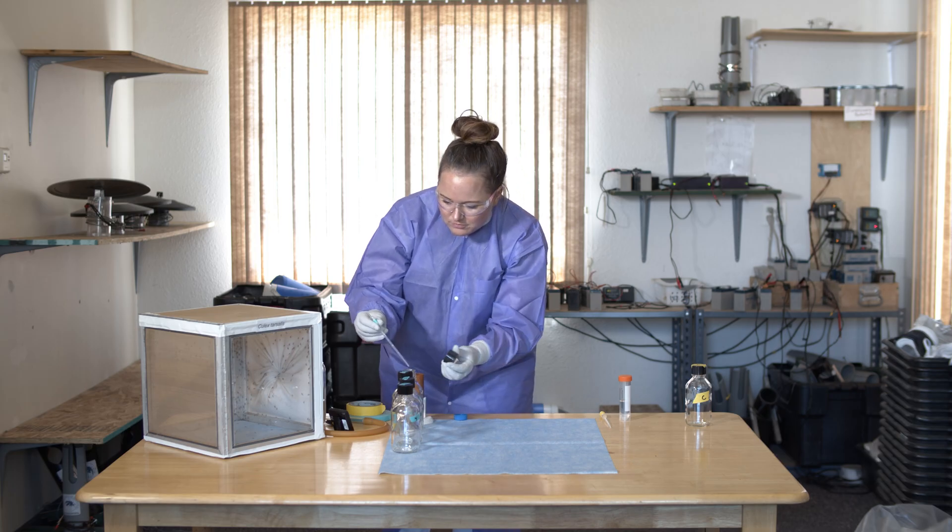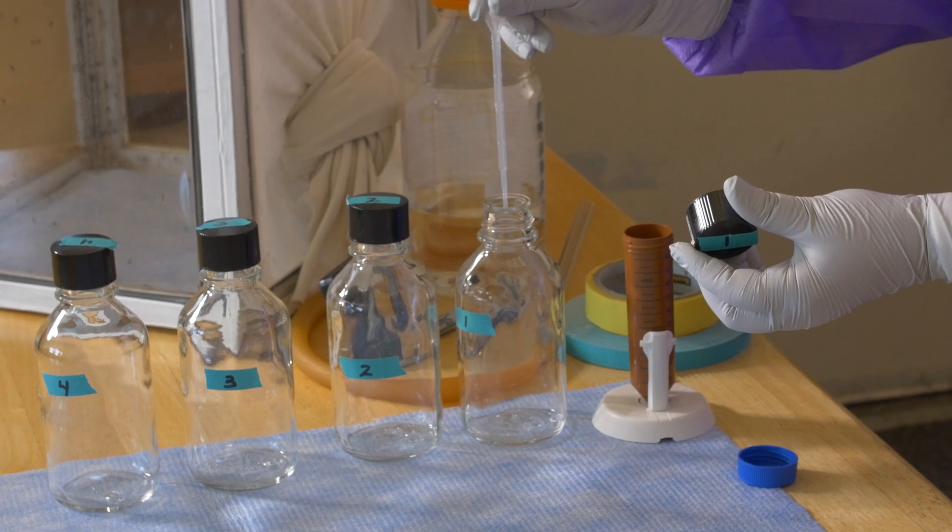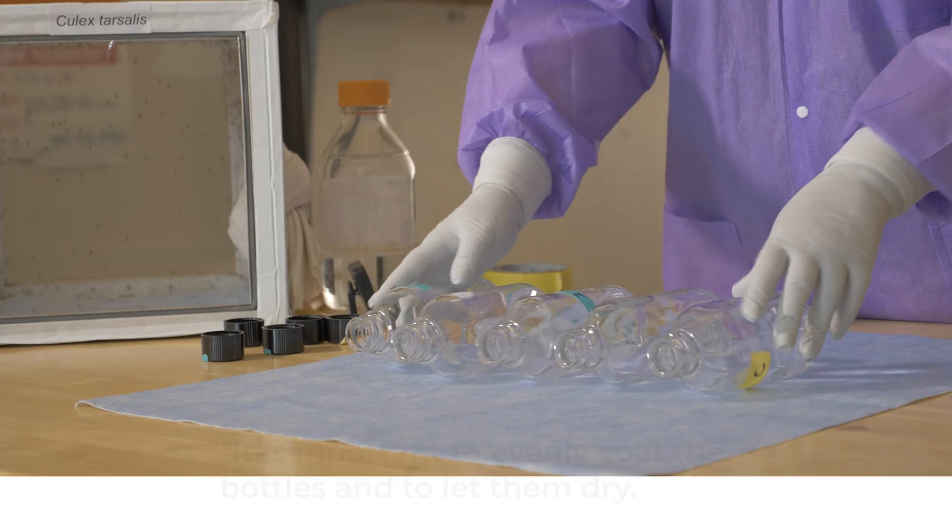To perform the CDC Bottle Bioassay, a bottle is coated with a known amount of insecticide. This is called the diagnostic dose.